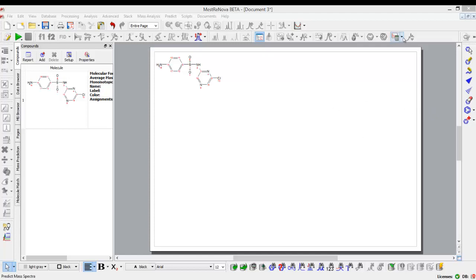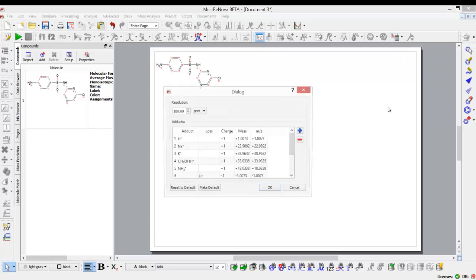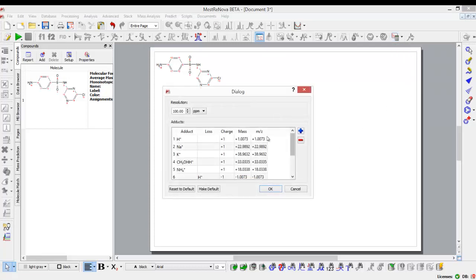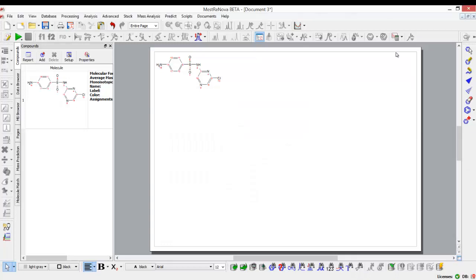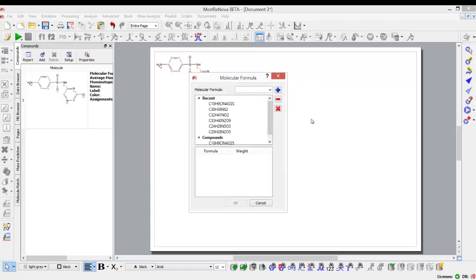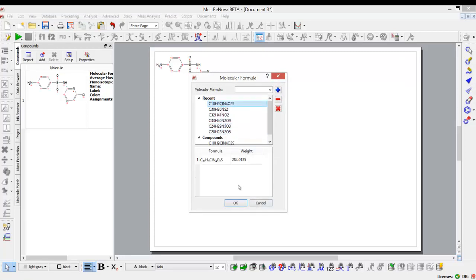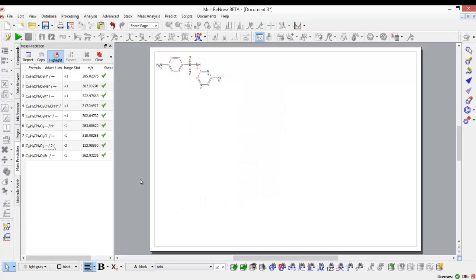Once I have my proposed compound, predicting what the MS will look like is very easy. I use the MS prediction functionality. I can choose my adduct and my resolution, and once I have set that, all I have to do is click on the predict button, select the relevant formula that I'm interested in for my relevant compound, and once I click OK, I get a list of predictions for the different adducts.